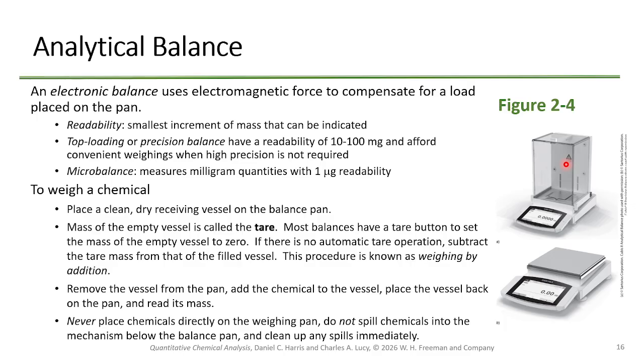Okay. And why would you need to close these windows? What would happen if you blow on this? You exhale during this measurement. It's going to read, right? It's going to read well over the microgram quantities. In fact, it'll read milligram-ish quantities. So like a 1 milligram quantity. That would be a breath. So you'll actually read yourself again.